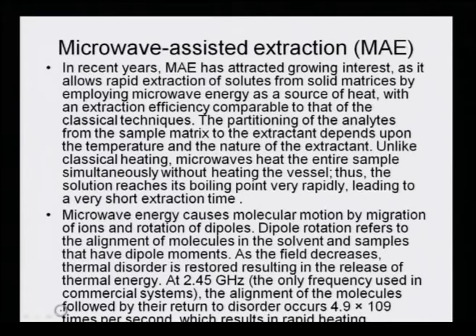Now, you must have seen microwaves being used in houses, but they are mostly for cooking purposes. But the same or similar phenomena can also be used to extract the analyte, and as mentioned earlier, the extraction process is much faster because the microwave energy only heats up the material and not the vessel.